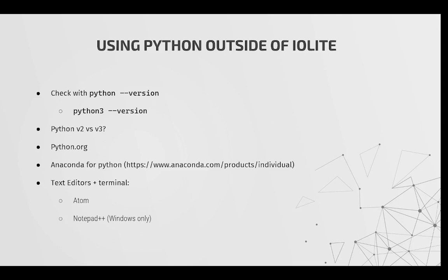Also, I just wanted to point out that in the early stages of the textbook, there's a couple of commands that, for slightly complicated reasons to explain, may not work if you're using IOLITE's Python console. The main one is just the input command, and you can get around it by using a separate version of Python for these first couple of weeks.